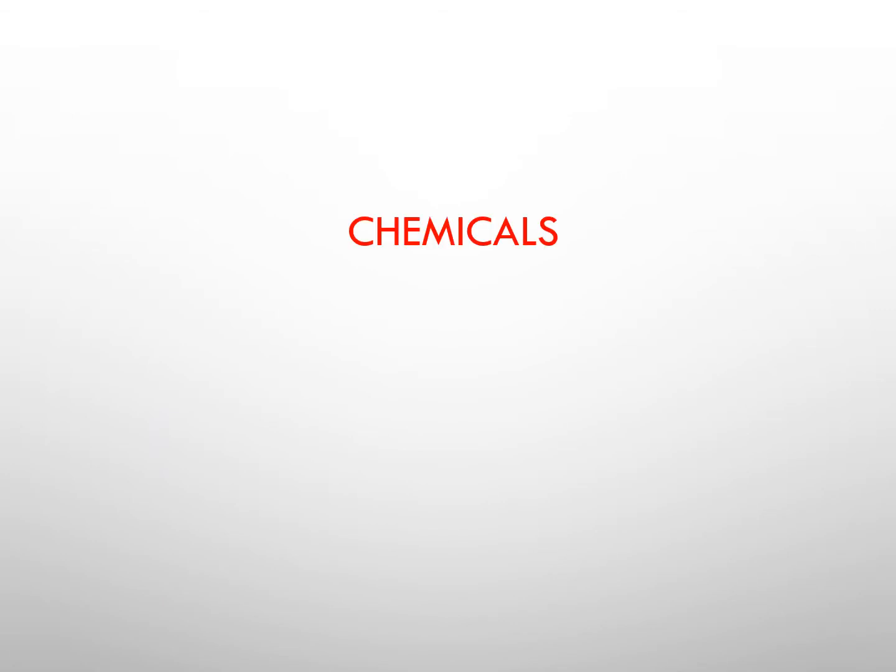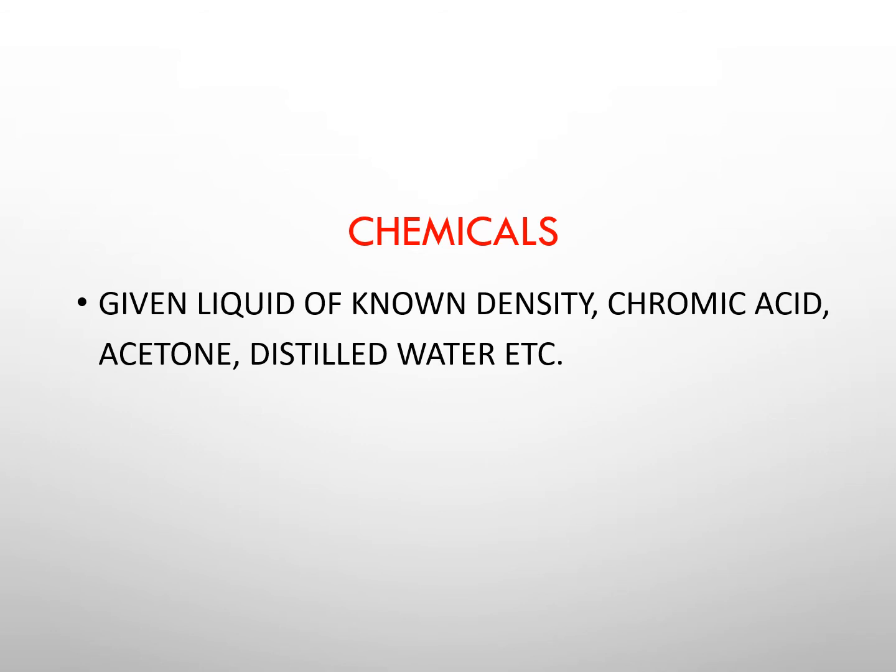Chemicals required for this experiment are: given liquid of known density, chromic acid, acetone, distilled water, etc.